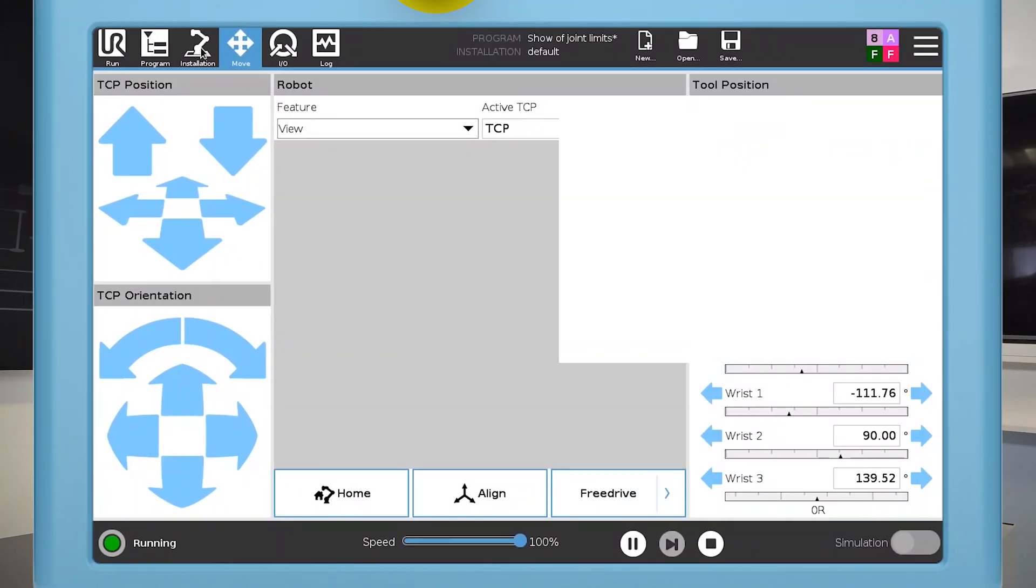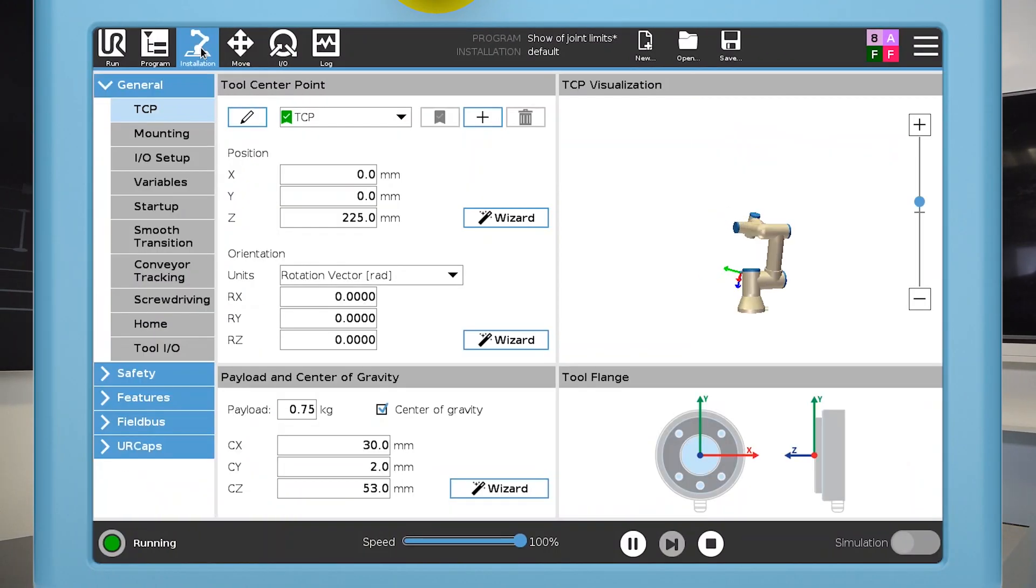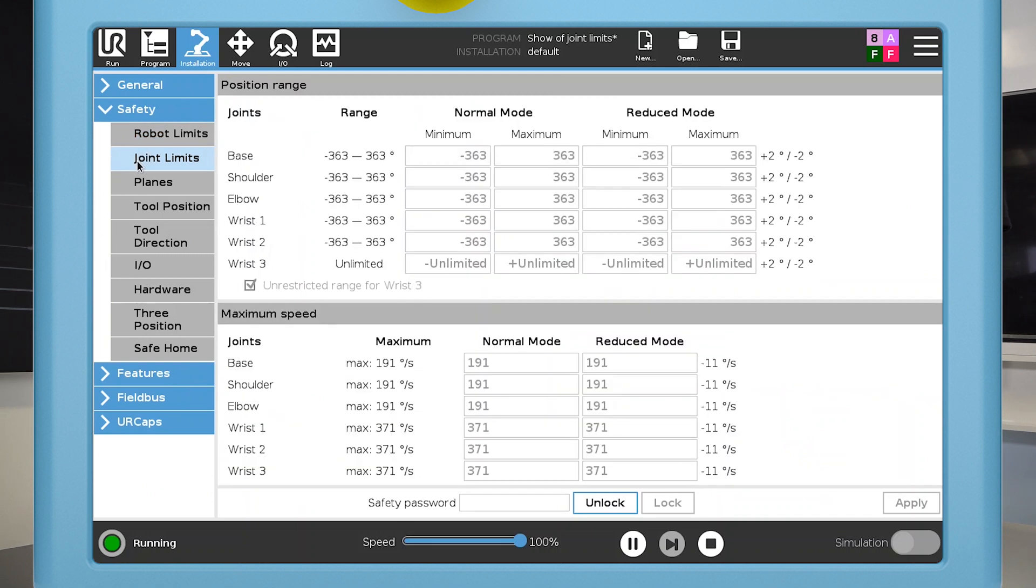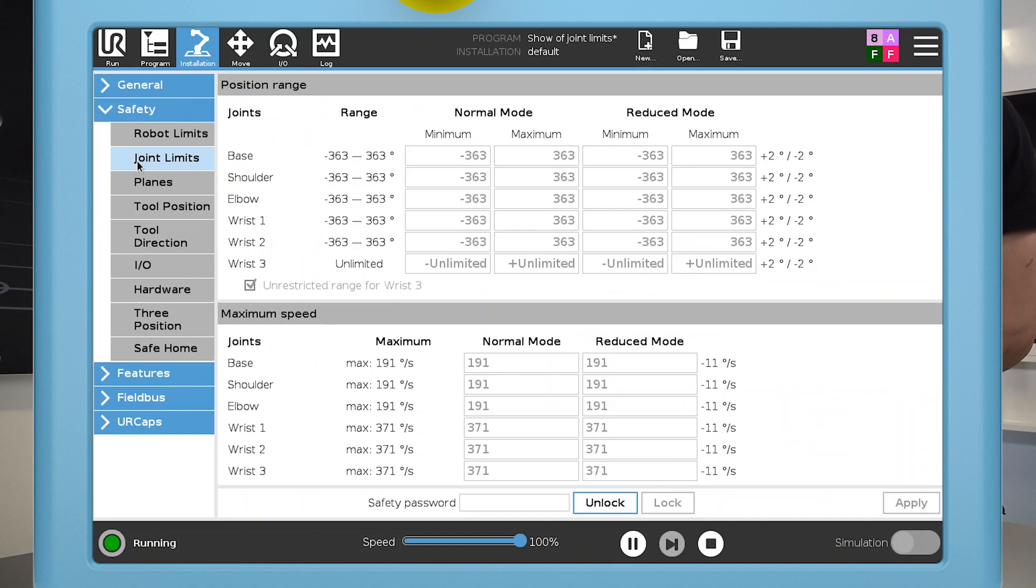To set the joint limits, go to the safety menu and select joint limits. Here you can set the range the joint is allowed to move within. As default, each joint can move in the range from negative 363 degrees to 363 degrees, which equals two full turns.